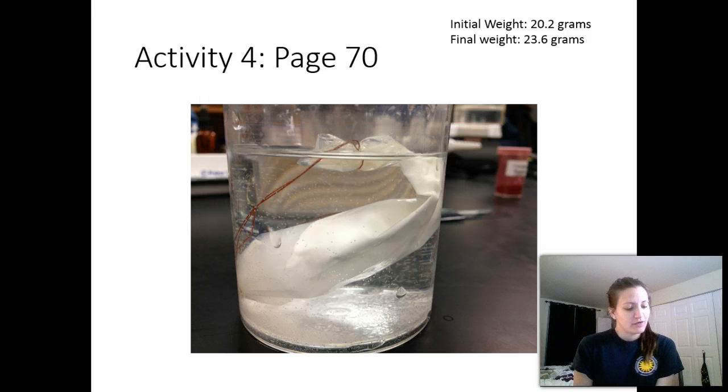Okay, so if we look at question 2, our final weight again was 23.6 grams. And that means that the bag gained weight. We were at 20 grams and now we're at 23. So depending on what your hypothesis was, this could be wrong or right.